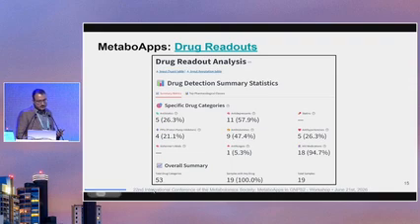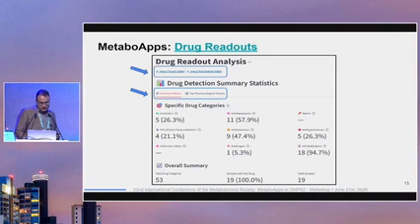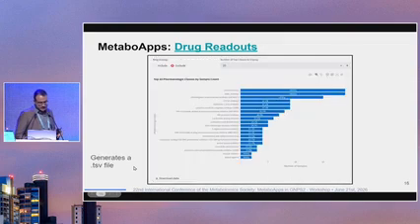The overall summary is going to show all the drug categories that are present in your sample, and you can also check the frequency that those metabolites are present in your data set based on the total amount of samples. Just going back here, if you select the top pharmacological classes, it's going to be populated on the same screen, but that's what you're going to see.